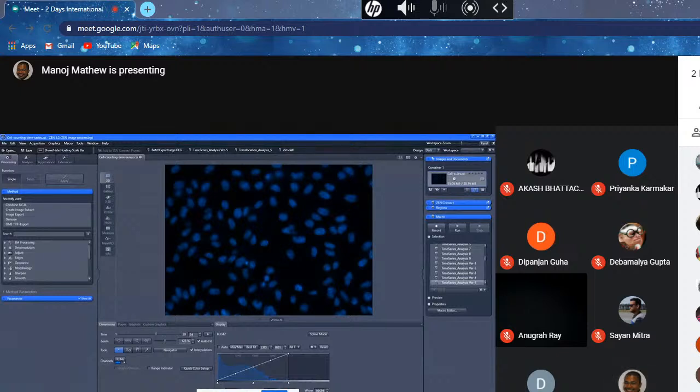And again, without actually seeing the image, that will be a bit difficult to tell. But in a software like the one I have shown or discussed, it's possible to segment two different categories of objects out. In fact, one of the demos I'm going to show you is exactly that. How do you identify two different groups of objects and then do analysis separately on these groups? Yes, it is in principle possible, but again, every image is different. And unless you actually take a look at the images, you cannot tell for certain.